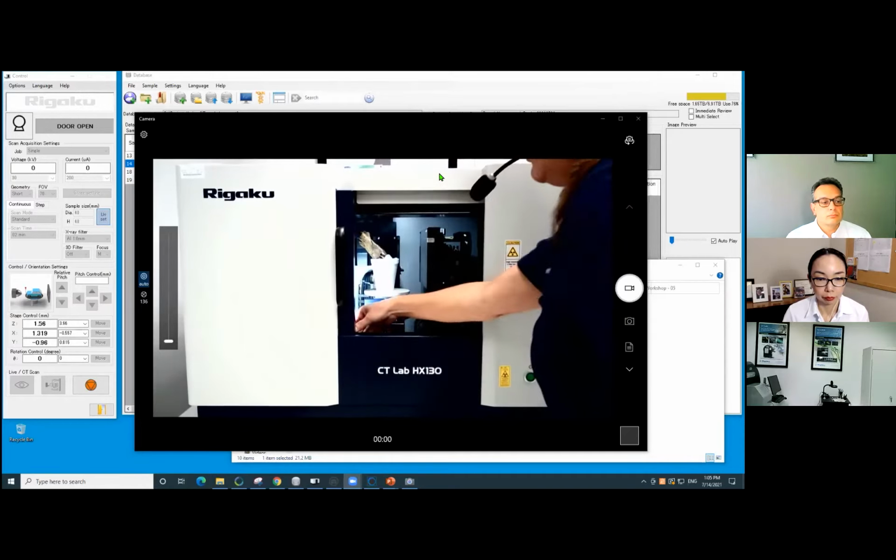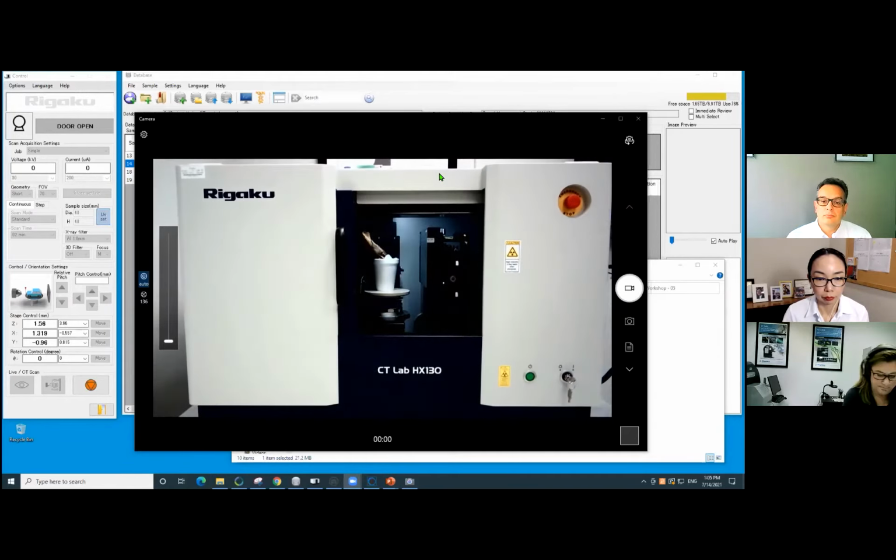And then we're ready to go. So I'm going to take my light out. And so for our first experiment, you're going to choose the data collection conditions in this case. So that leads us into our first polling question.